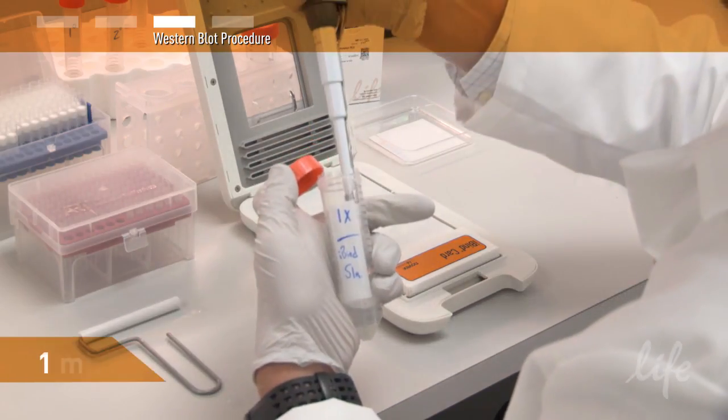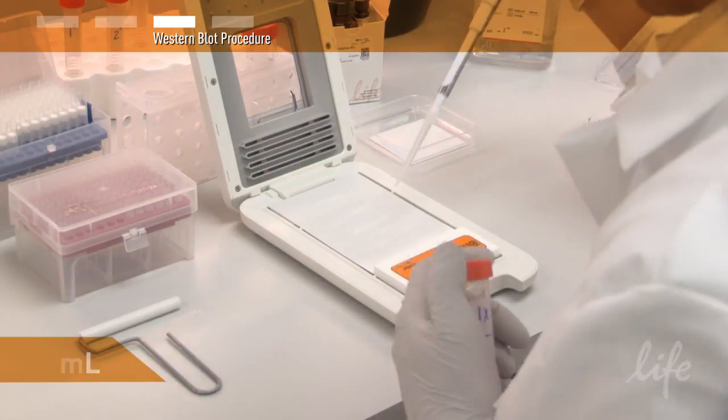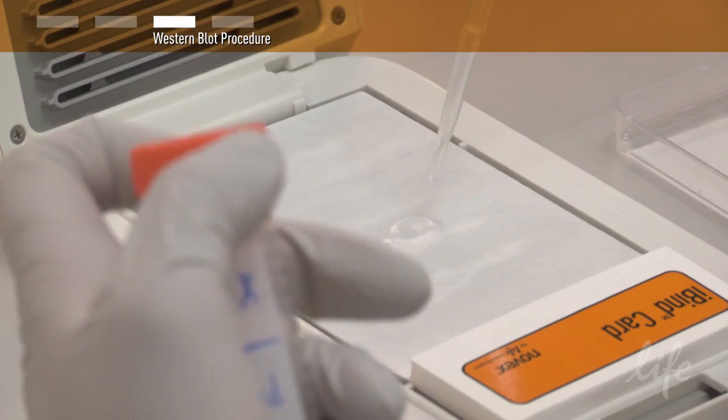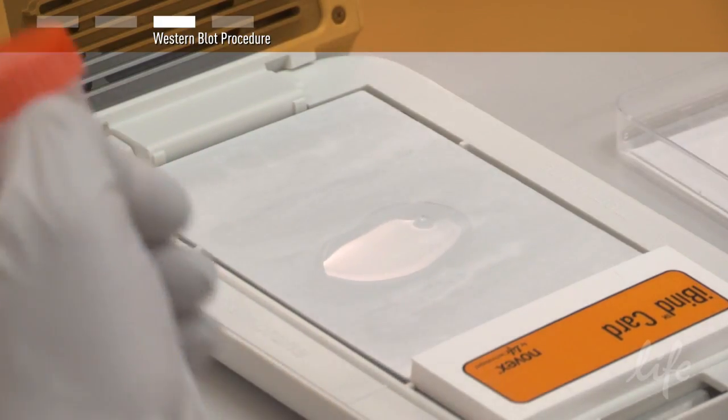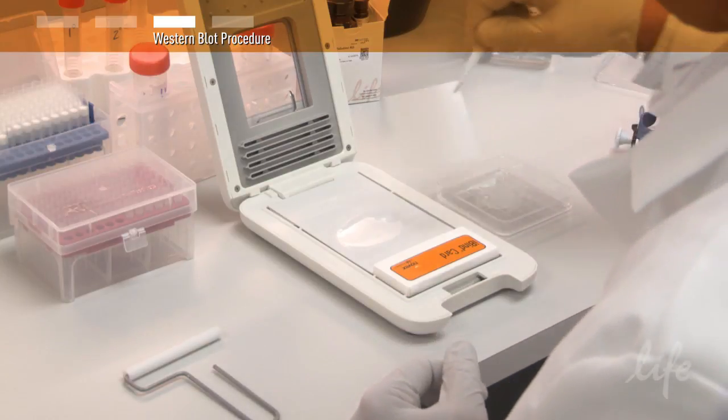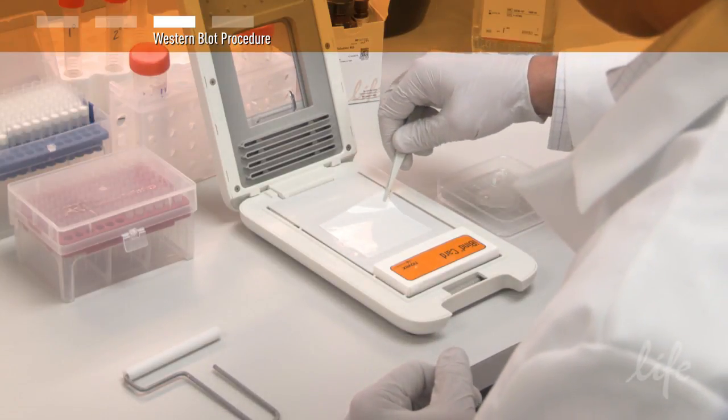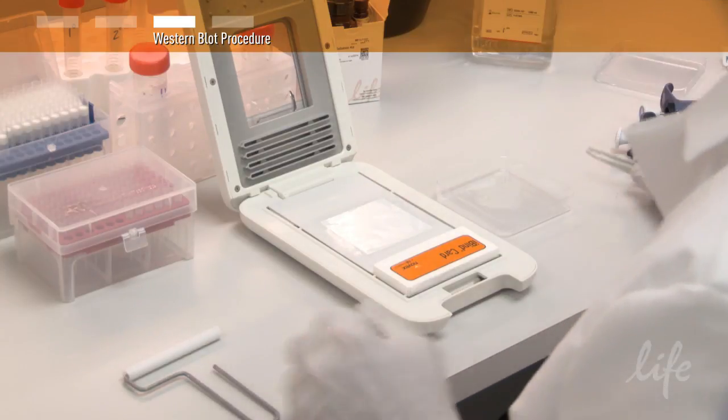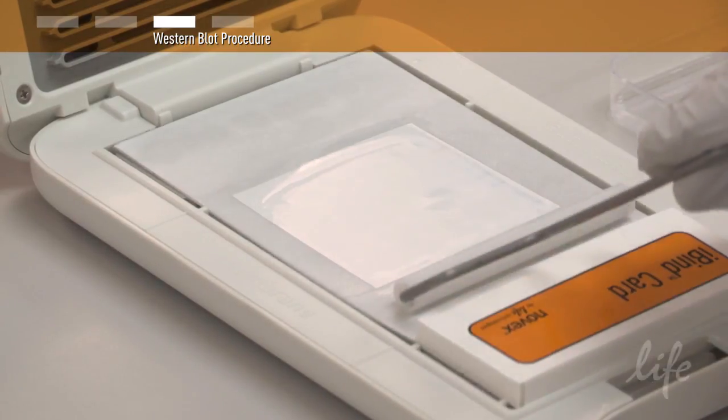Add 1 milliliter of the 1X iBind solution in the middle of the membrane region of the card so that it pools in the center. Place the membrane directly on top of the pooled solution with the protein side down and the low molecular weight proteins closest to the stack.